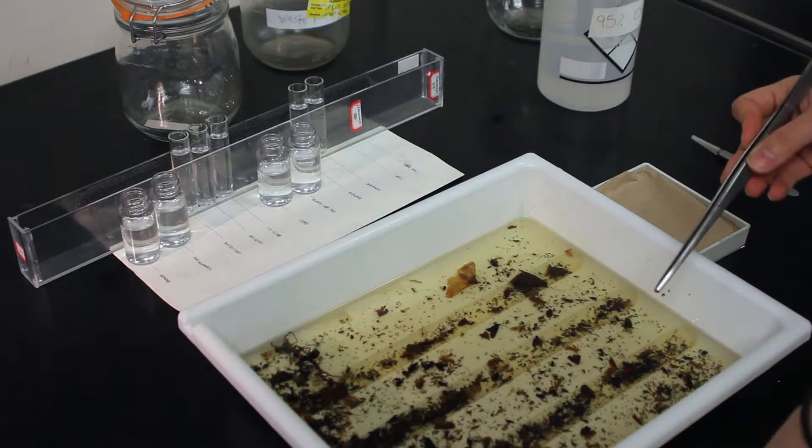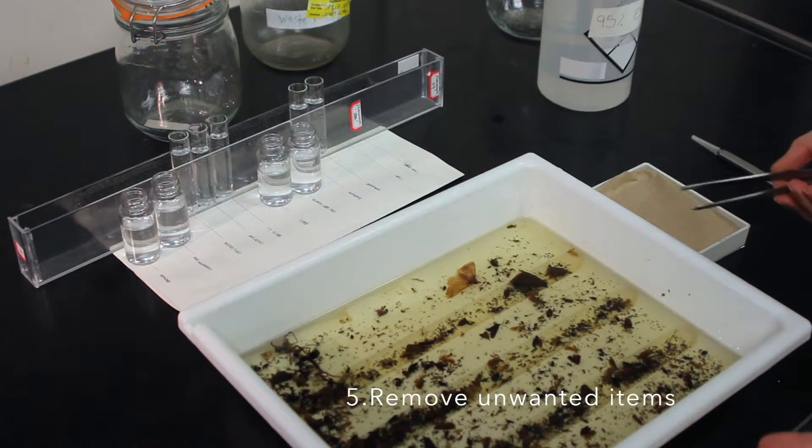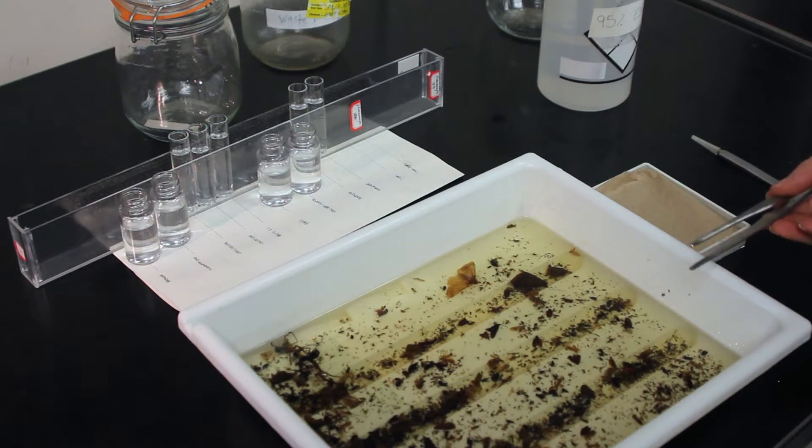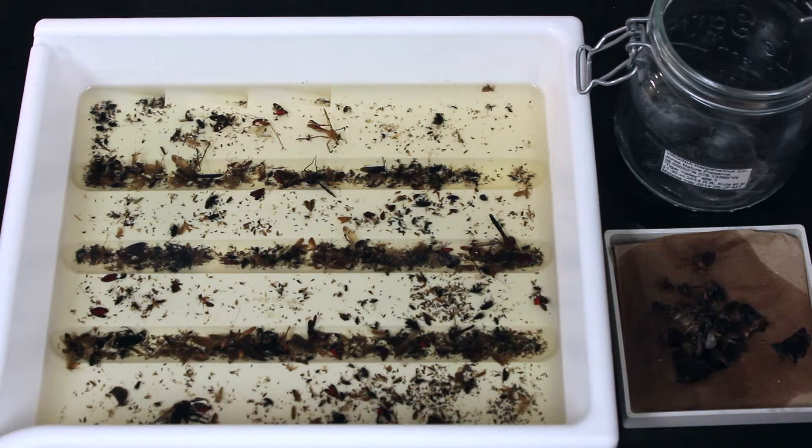Our next job is to remove any debris and vegetation that are going to get in the way when we're sorting our sample. Once all the lepidoptera have been removed, we focus on all non-target macro organisms that we still want to conserve. And they'll go into the externally labeled bale top jar.